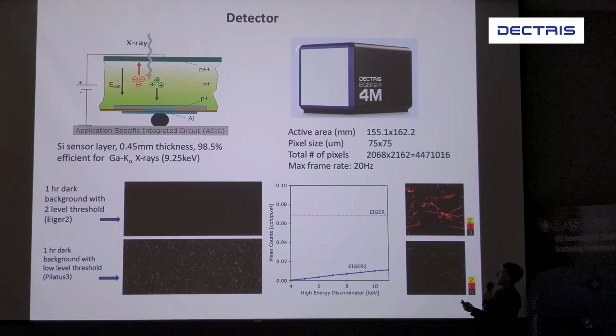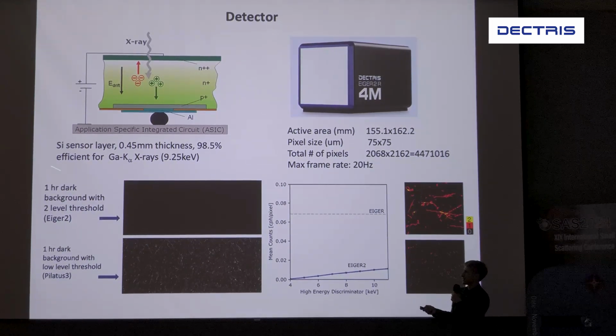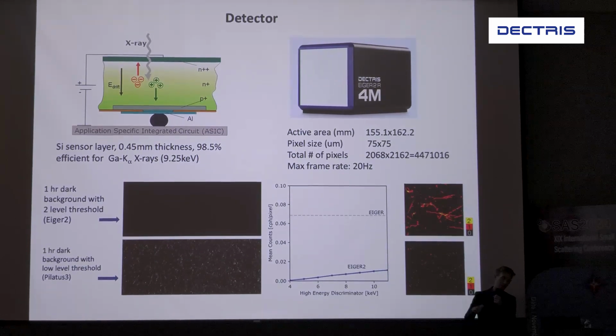On the other hand, we have the detector, which is the EIGER 2R4M. As you know, this is the best detector money can buy. And the big thing about the EIGER 2 is that it has 2 threshold suppression in order to lower the background noise. So you can see this was from their manual. You can see that this is a 2 threshold with 1, and this is a Pilatus 3 with 1 threshold. I decided this week to run that experiment myself.